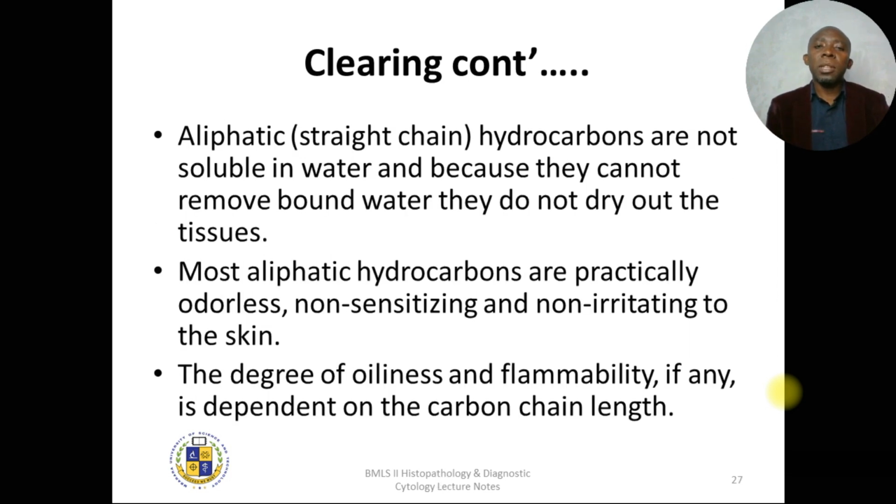Apart from the limonenes, we also have the aliphatics, which are straight chain hydrocarbons that are not soluble in water, and because they cannot remove bound water, they do not dry out the tissue. Remember the other one we said removes water and causes drying out of the tissue. These ones don't dry out the tissue.